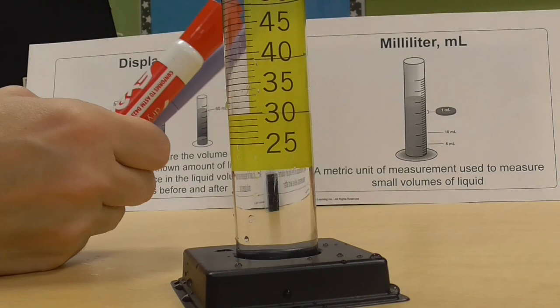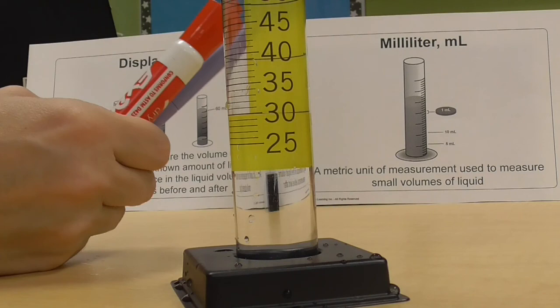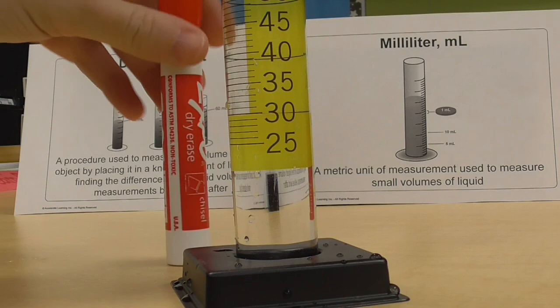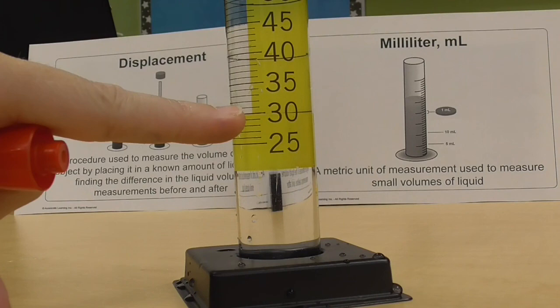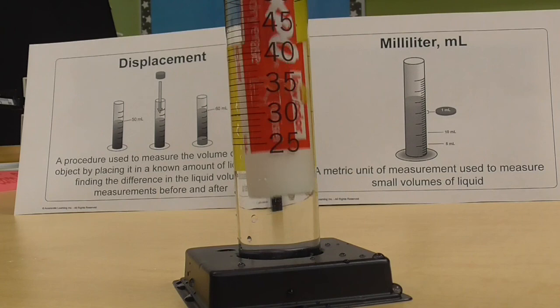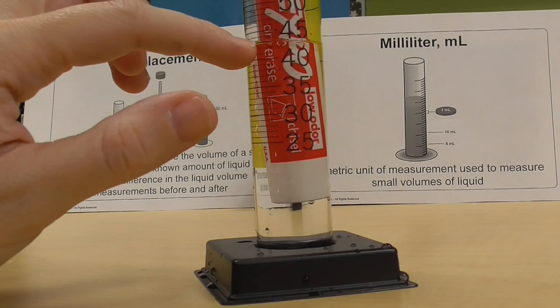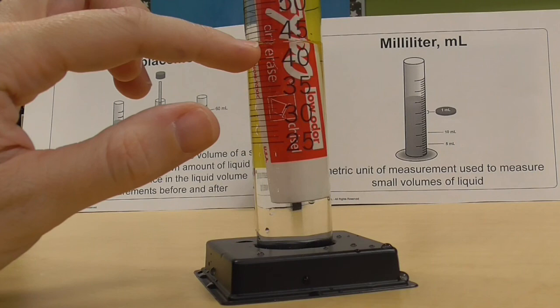So when I drop one of my irregular shaped objects, I'm going to do my marker. We're going to see the end volume of what it ends at after we drop it in. So this is our beginning, 30 milliliters. When I drop it in like so, there it is. It went all the way up here. That's 41, 42, 43. I'm at 43 milliliters. So I started at 30. I ended at 43.